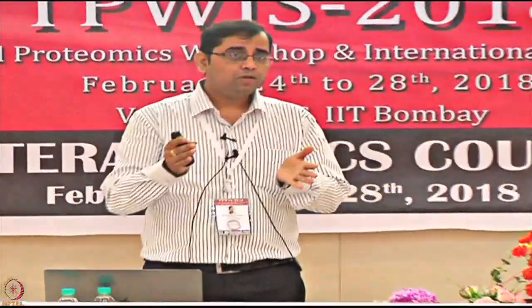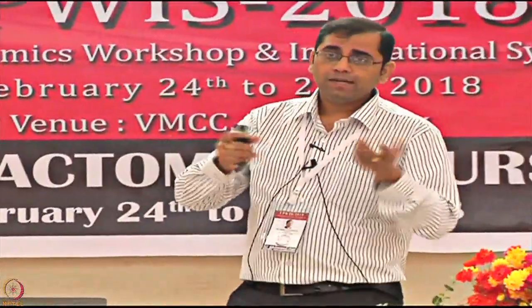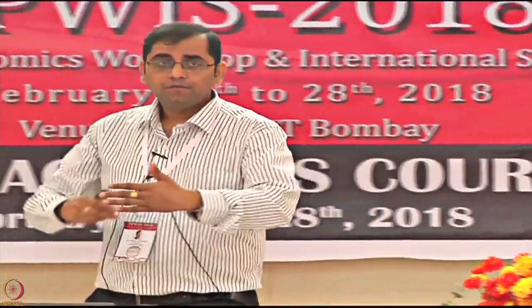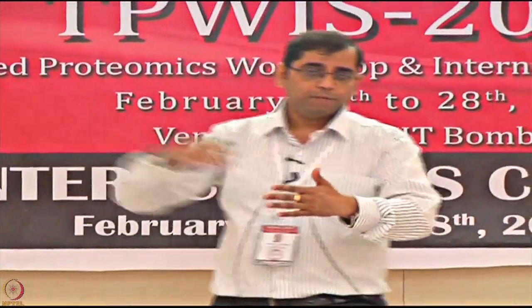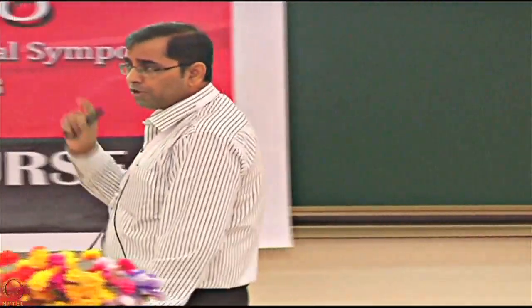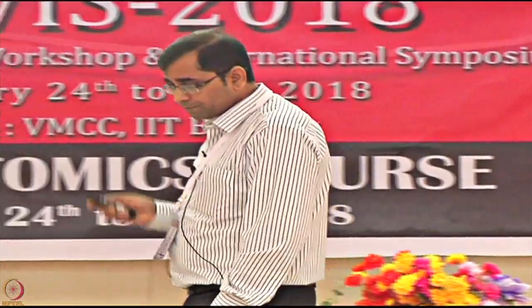So take one flow cell, let's say. I'm sure you are aware of the different flow cells involved in the Biacore experiment, for example. One flow cell you can just block, and it can be used for your QC checks across many experiments, and you can vary the other flow cell for testing your unknowns. So you will still have full control as you go along, knowing the chip has not gone bad and the positive control molecules are behaving the same way.